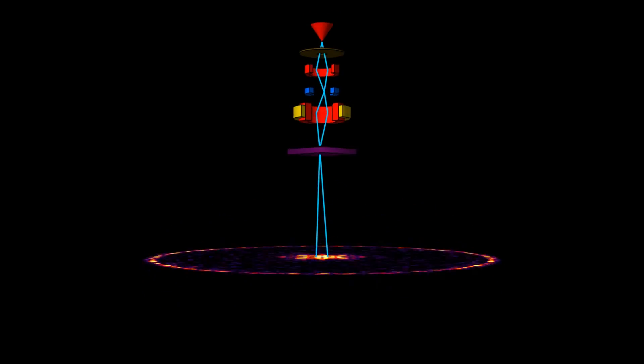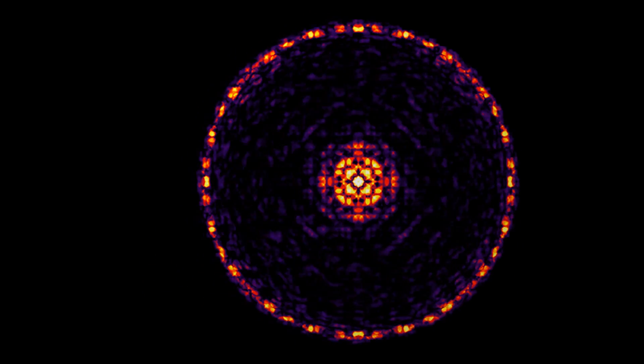With conventional electron microscopy, we can now see down to atomic resolution. But if you want to measure atomic scale properties like the separation of atoms, you have to be able to see all of those atoms in the field of view. What this new camera will allow us to do is make measurements on atomic scale properties but over much larger fields of view.